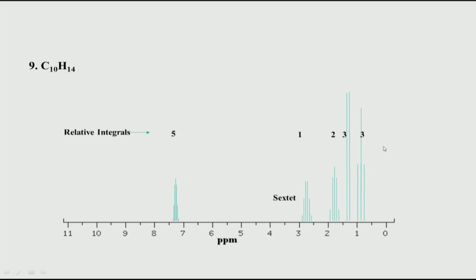And now coming back to here, this is again the standard interpretation we have been doing. What we have here is a triplet, a doublet, a quintet, and a sextet. Now, a sextet means 5 neighbouring protons, since 5 protons will give you a sextet.